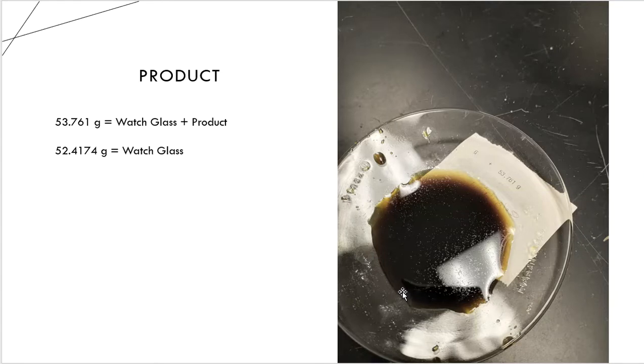And the first round was just a sign that the aluminum chloride, because it was anhydrous, was not necessarily anhydrous. There was too much water weight associated with it, and it couldn't do the job that the aluminum chloride was supposed to do in the acylation reaction.